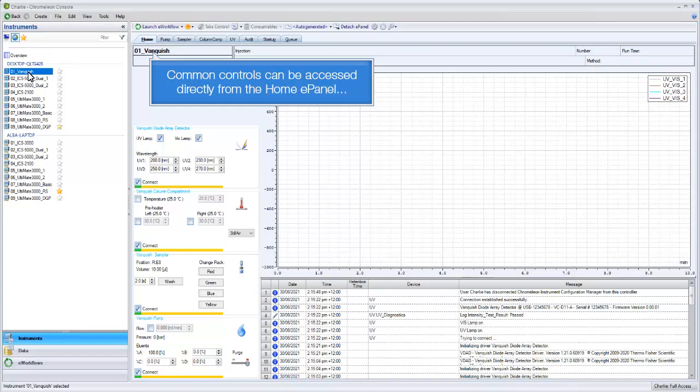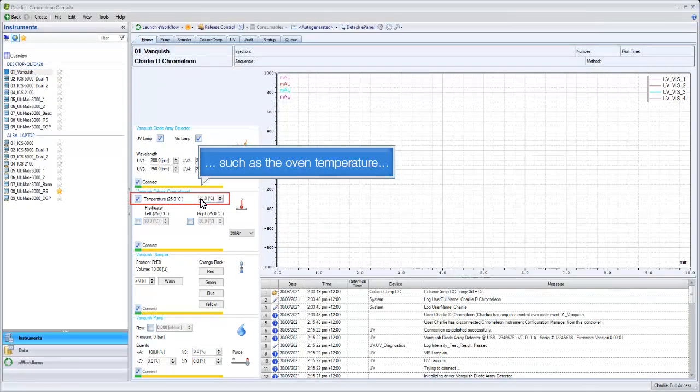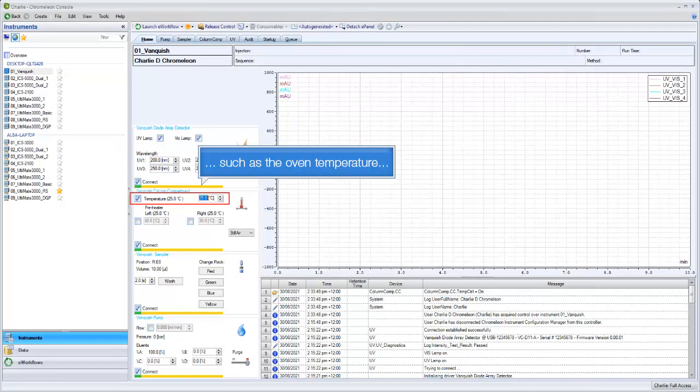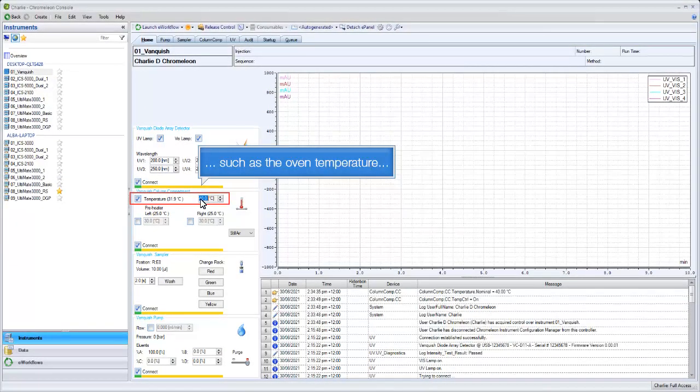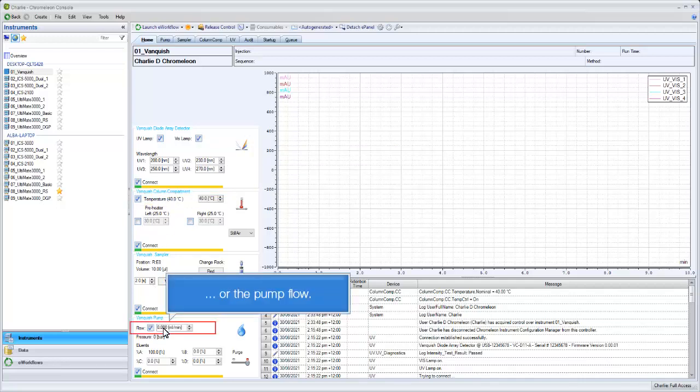Common controls can be accessed directly from the Home ePanel, such as the oven temperature or the pump flow.